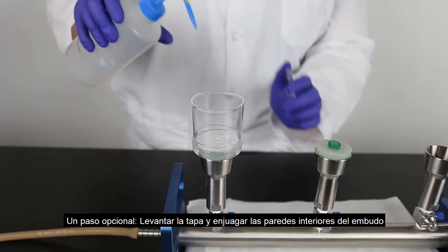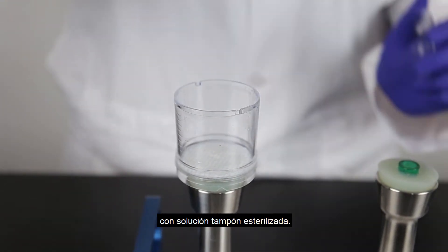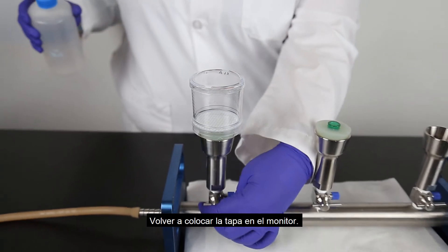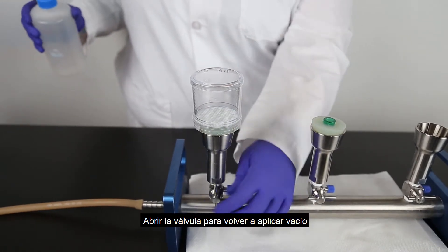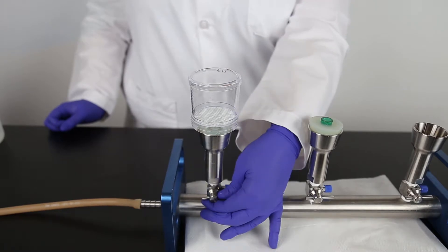An optional step: lift the cover and rinse the inside walls of the funnel with sterile buffer. Place the lid back on the monitor. Open the valve to reapply the vacuum long enough to pull the additional buffer through the membrane, then close the valve.